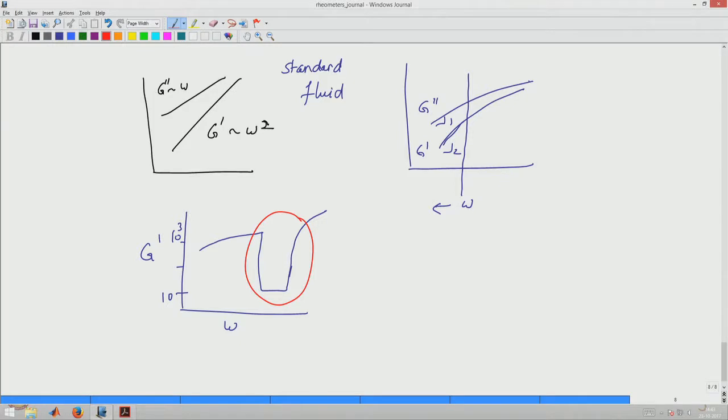So, the other thing you can do, for example, is say okay, I did this experiment at 2% strain, let me now change to 4% strain and then see. So, all the possibilities are there, yes. The other thing you could also do is go to high frequency and then reverse. You can say now let me go the other way and see what the instrument gives. If while coming back I get some data like this, then oops, there is something related to instrument operation, maybe the sample is not doing it, it is possible, right.